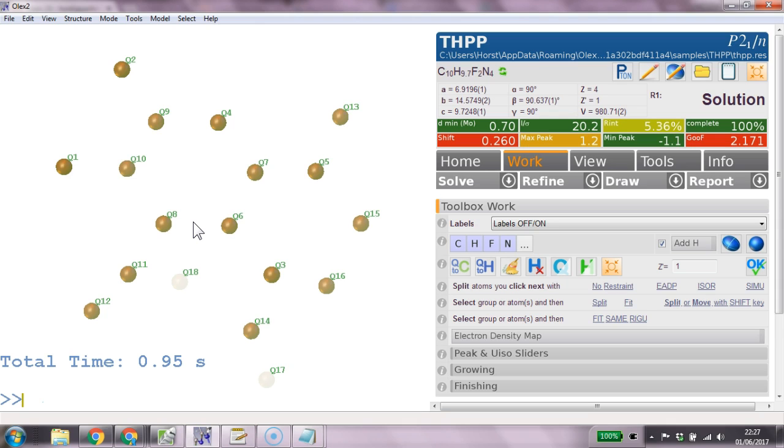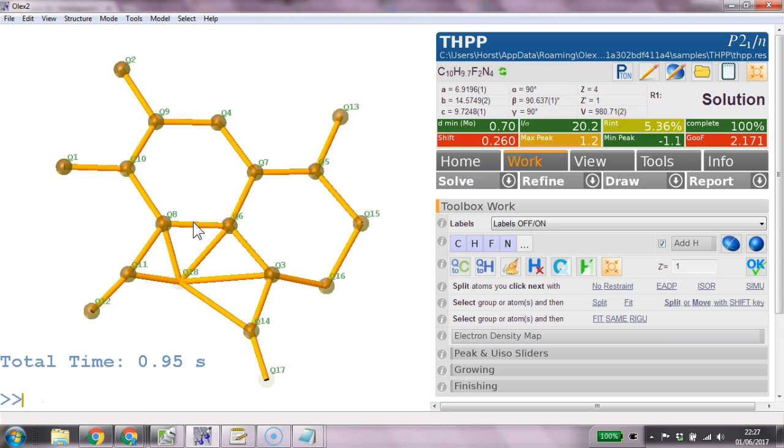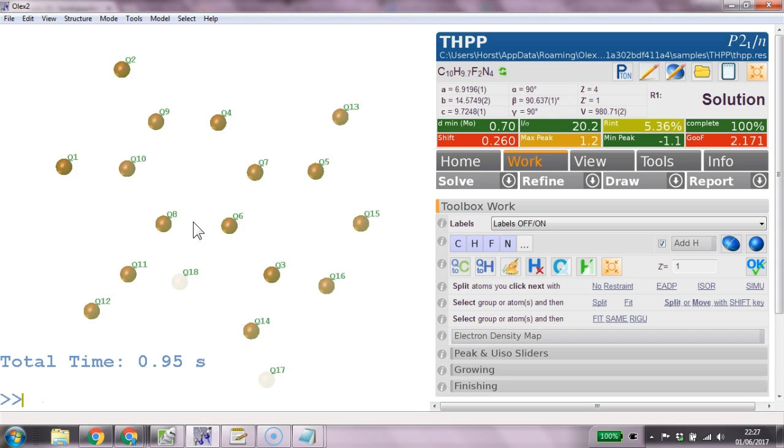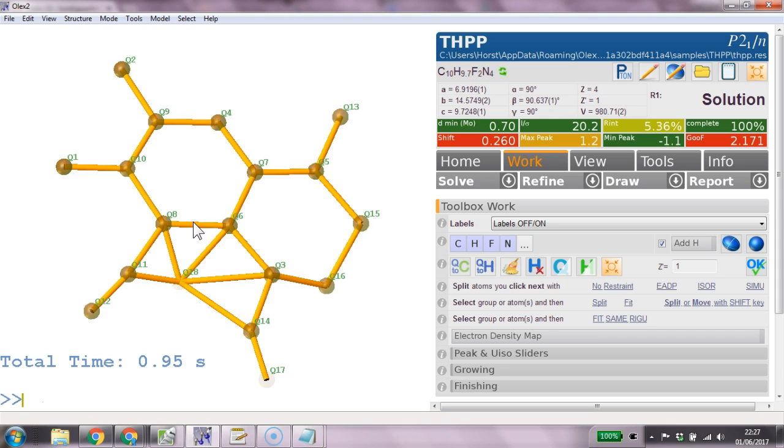And now CTRL Q we can show the Q peaks with the bonds and hide the Q peaks altogether and show them without the bonds.